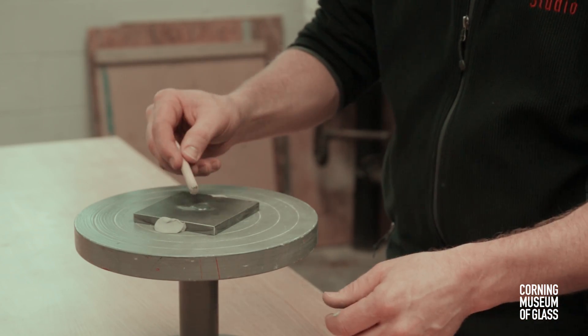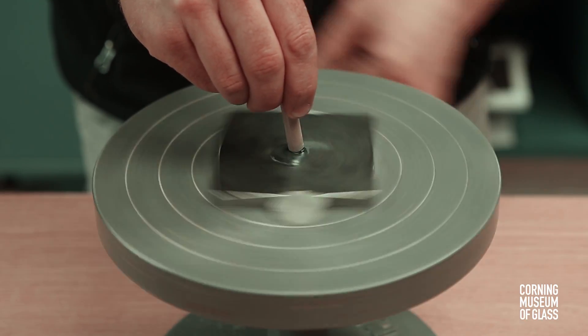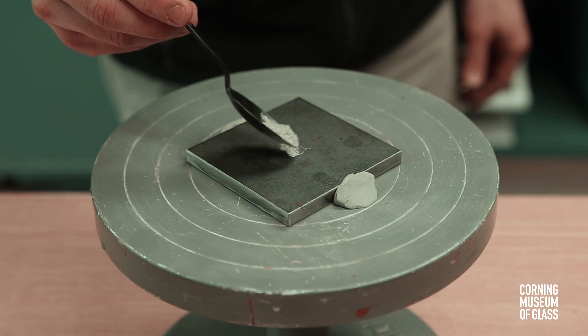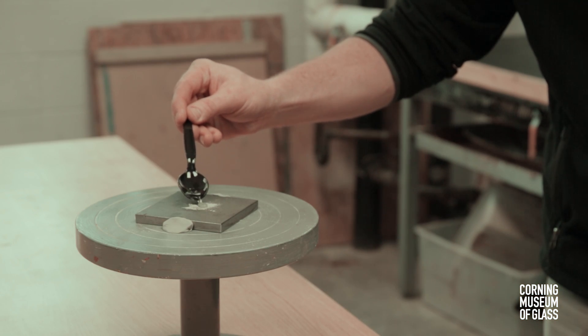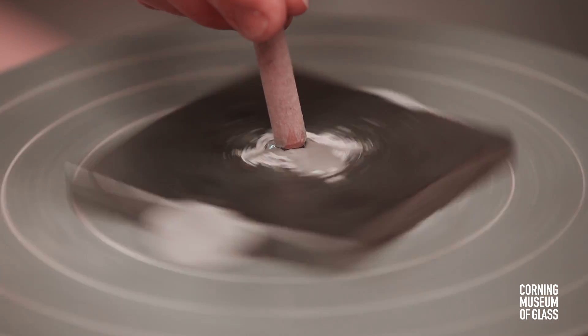We don't know how many different grits van Leeuwenhoek used. Sometimes just grinding was enough to produce a completed lens. Other times, the finest grit sand or even putty was put on a piece of felt or leather to polish the lens and remove surface irregularities.